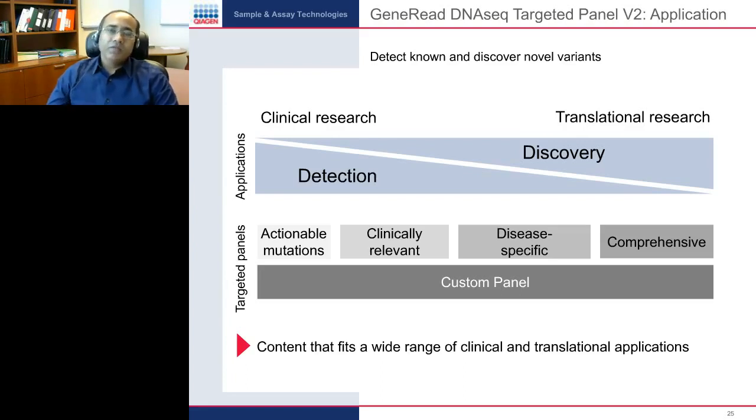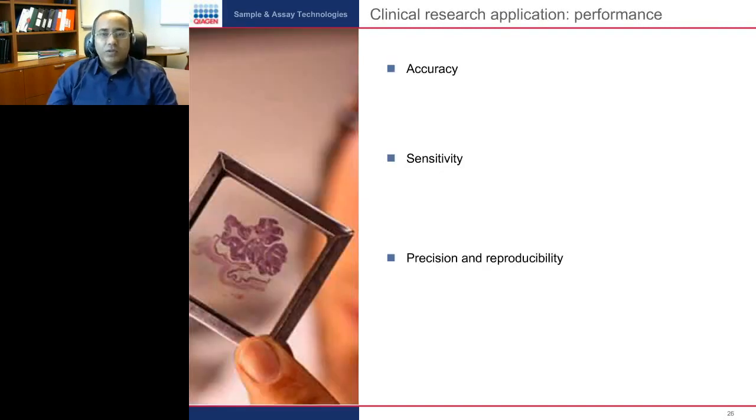But when we are talking about clinical research, we have to look into the accuracy, sensitivity, precision, and reproducibility of the panels we would like to use.